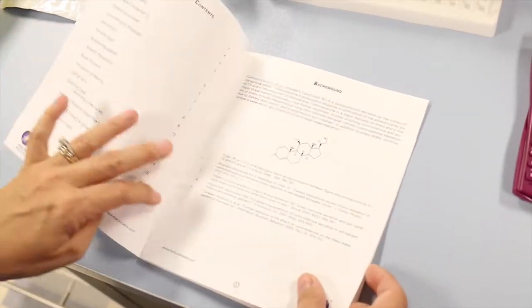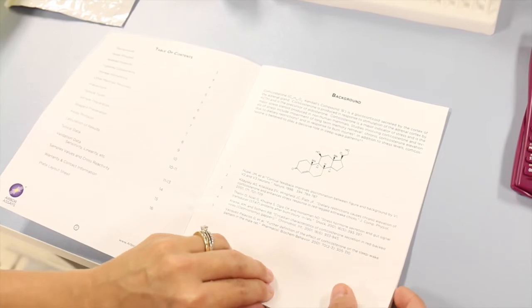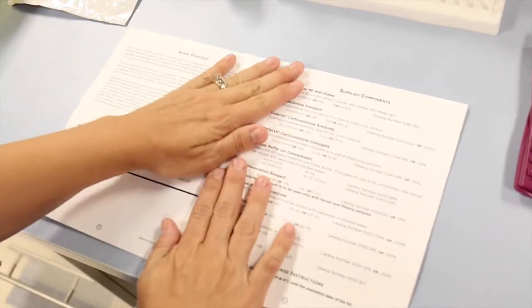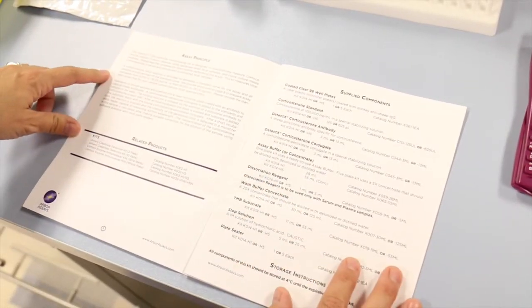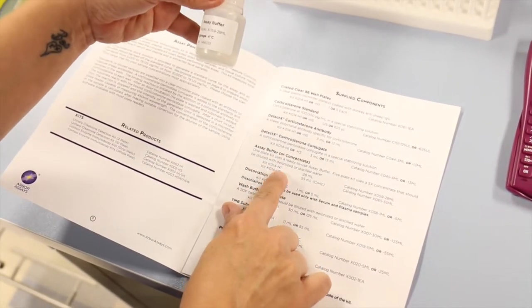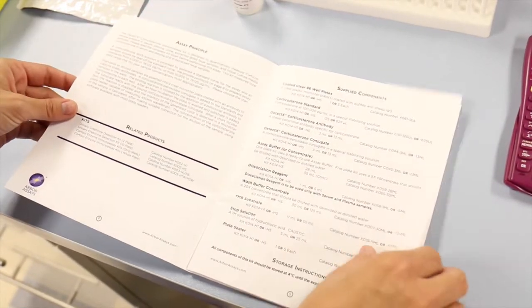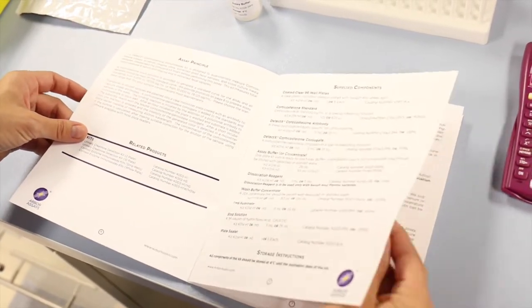Thoroughly read the protocol that came in the kit box. We constantly update the kits and the protocols to improve performance, so look for revisions to the protocol. Contact us prior to using the kit if any of the instructions are unclear.